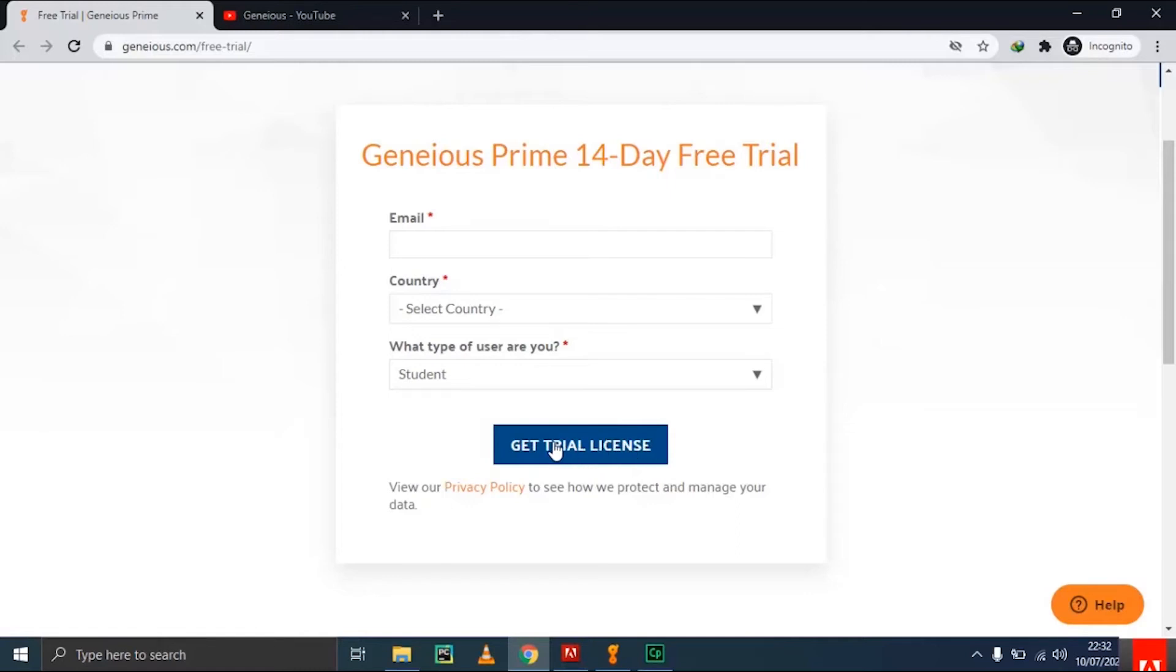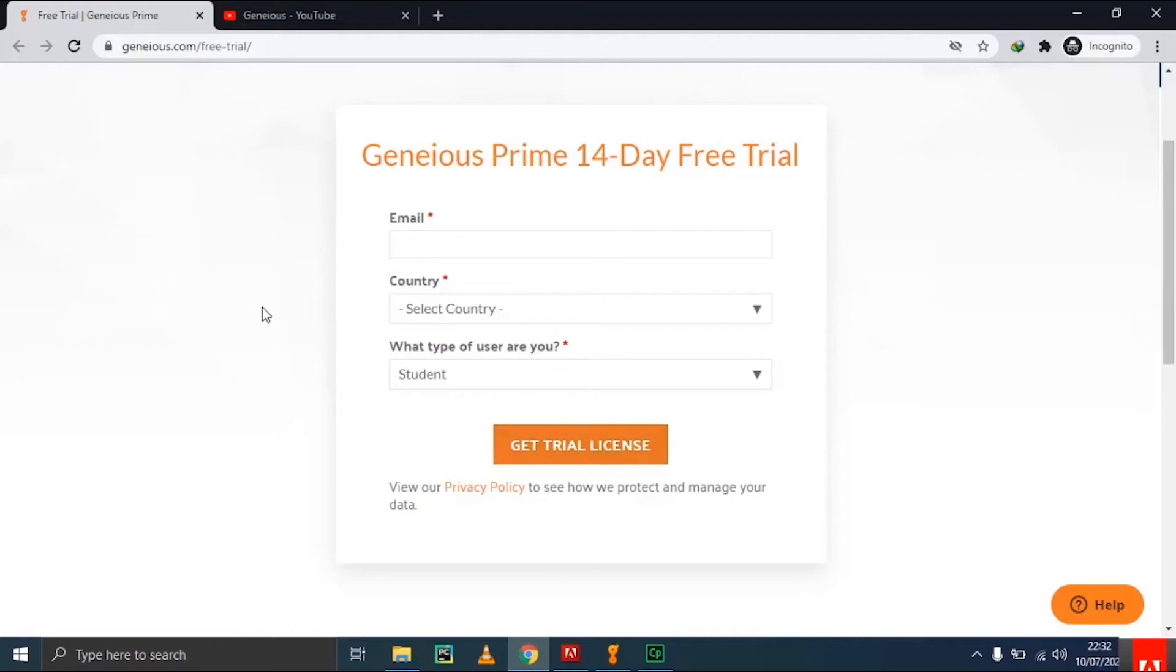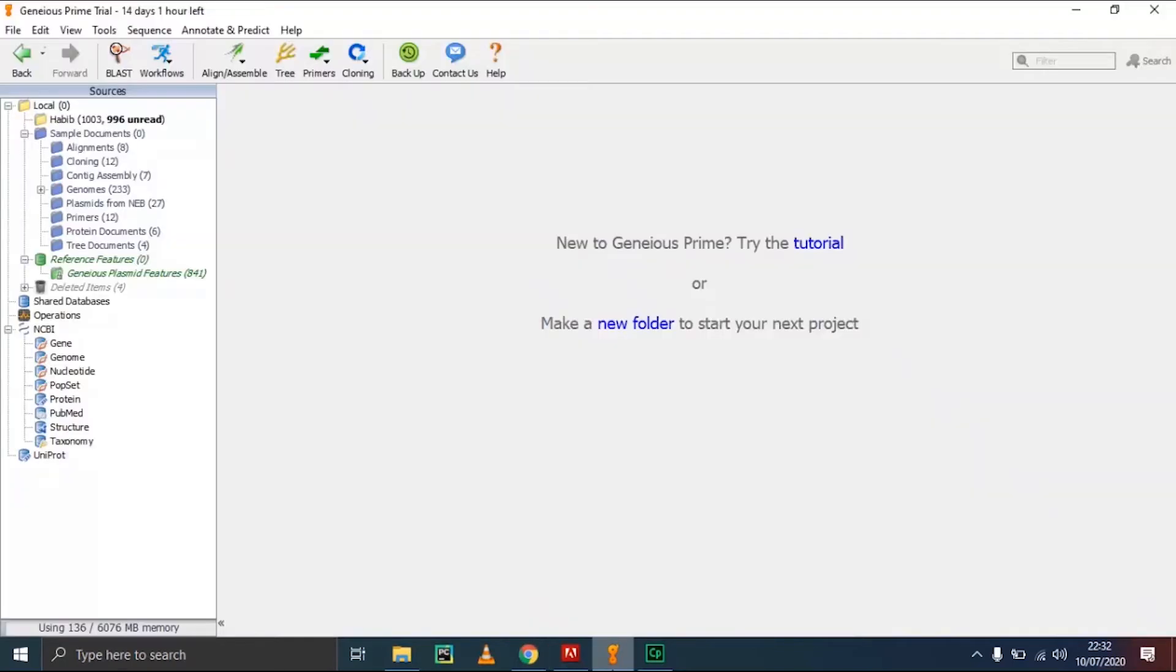It will take you to the downloading page. I have already downloaded the software, so I will simply open it. After downloading, it's a basic installation where you can select the directory where you want to install.